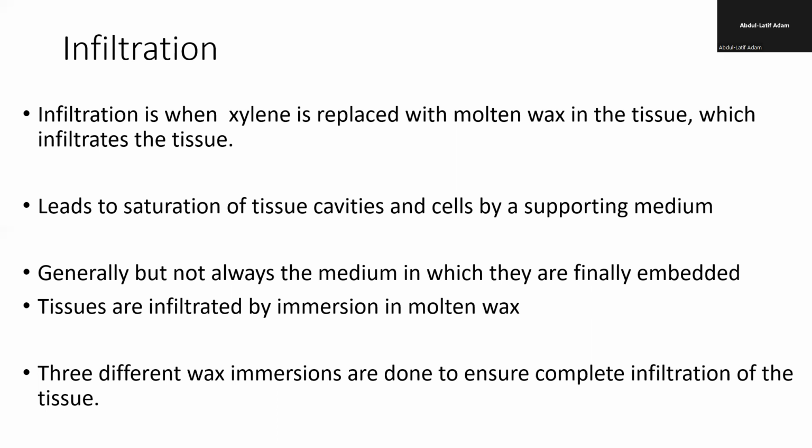Okay, so this also depends on the melting point of the wax. Very, very important, to enhance complete infiltration. Then you have some vacuum to allow the penetration and agitation, also to create the current that will allow free flow of the molten paraffin wax in the tissue.